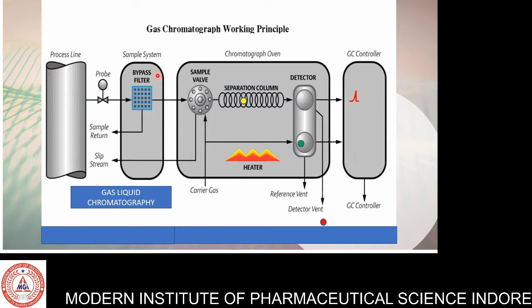Liquid sample is injected by microsyringe with a needle inserted through the self-sealing silicon rubber septum into a heated metal block of resistant heater. Gas samples are injected by gas tight syringe or through the loop and valves.